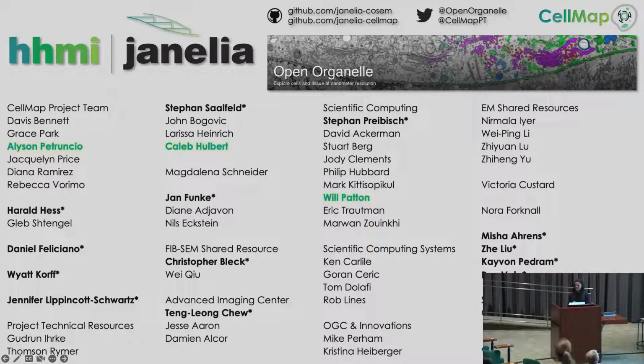Right. And I would say that, in EM images, this usually falls in the category of things like autophagosomes, the endosomal system, and tons of vesicles throughout the cell. So we don't find those pointedly, but you get to explore them more.